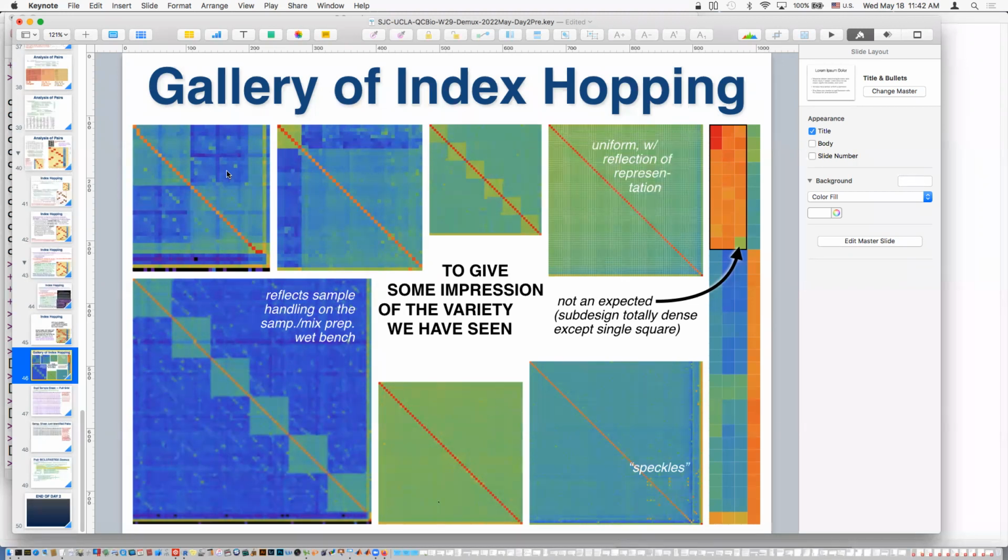I mean, if this has some effect, this is 1%, whatever. There's all kinds of things. But if you have some analysis that actually is really sensitive to cross contamination, and you made some kind of PCA plot or whatever your samples are, and you get clusters, you're probably going to get clusters controlled by these blocks. So this is cross contaminant structure.